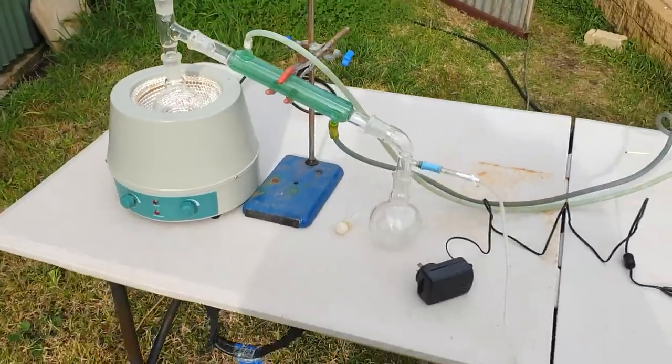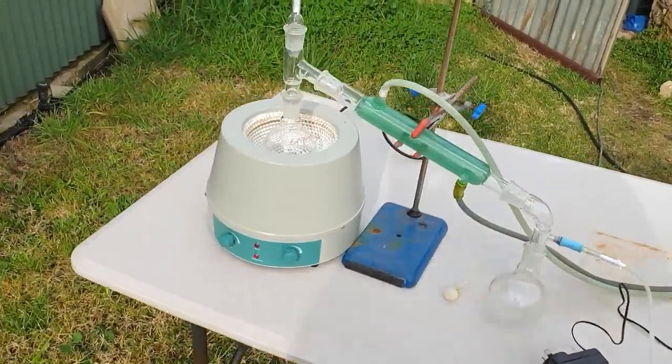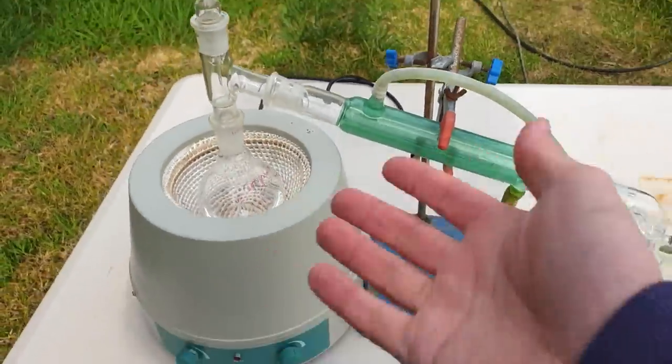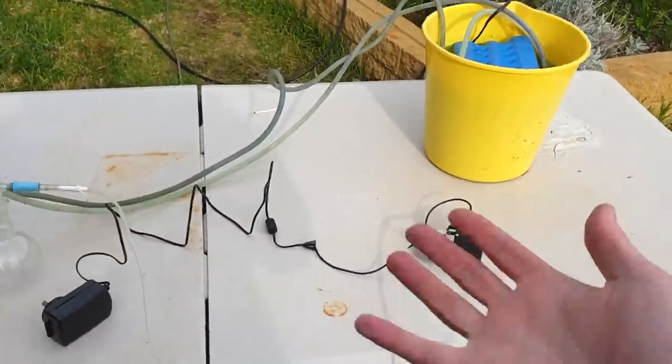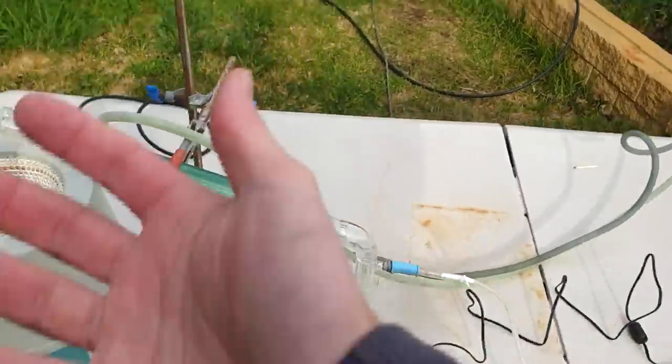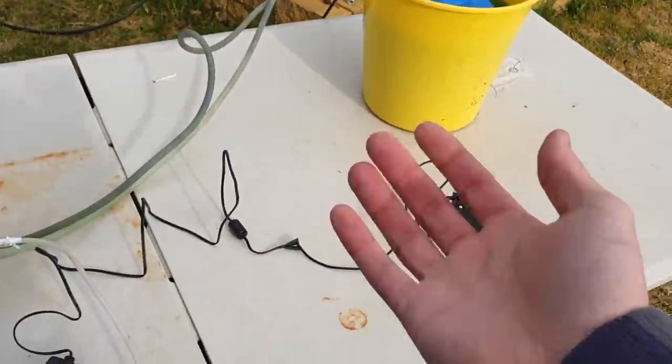But really, it's quite a big unknown. So rather than just jump straight to our precious substrate, what we've got here is some water. So we're just going to be boiling some water. We should be able to tell what our vacuum strength is, because we know water boils at 100 degrees at room pressure. But we don't know what pressure our vacuum pulls.